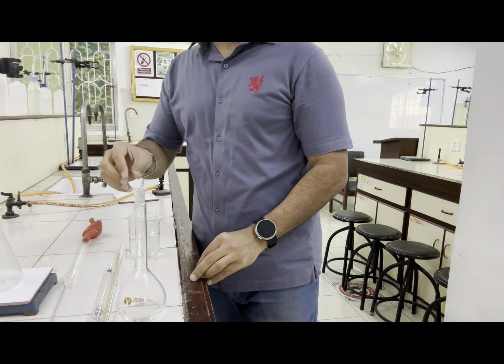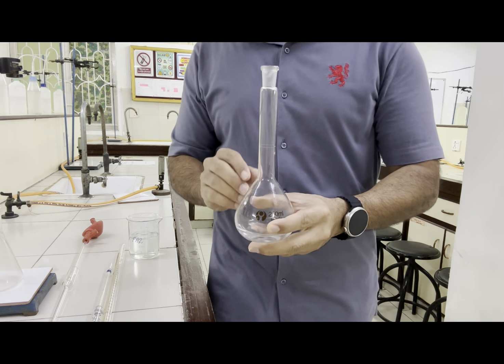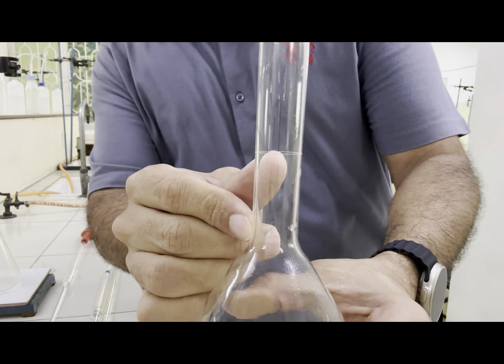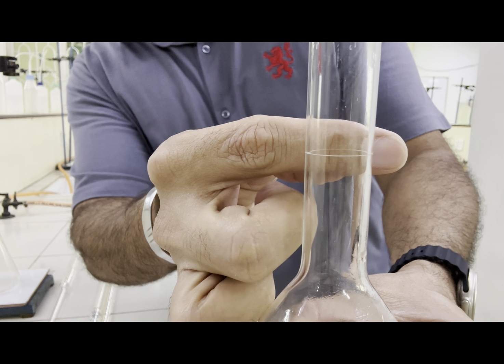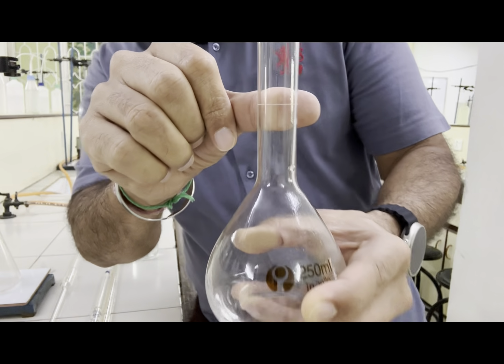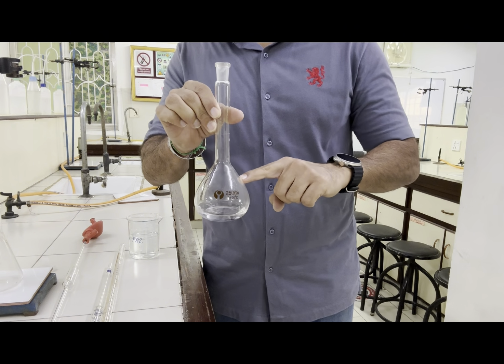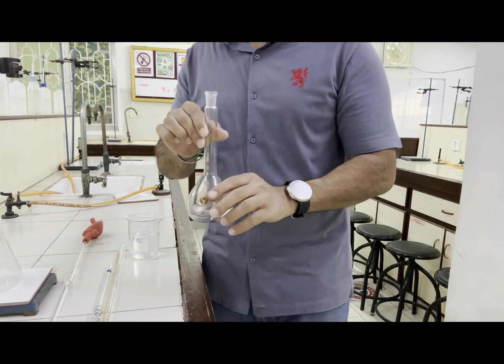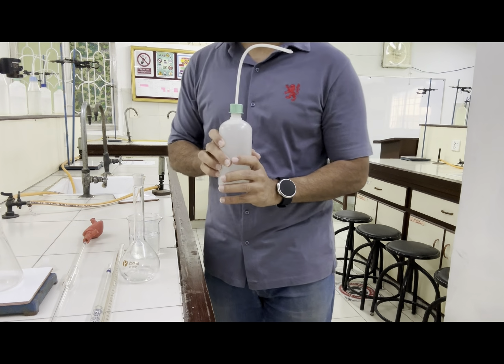Now, this volumetric flask needs to be filled up till this mark. Here you can see there is a mark. Up till here, the volume becomes 250 exactly. So for that, you need to fill this volumetric flask with distilled water. So let's take distilled water here.